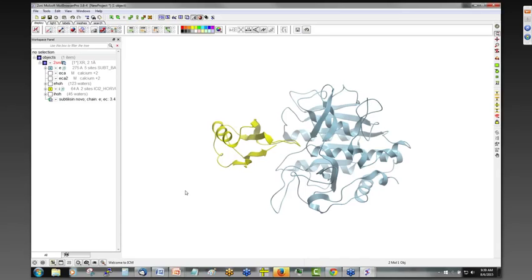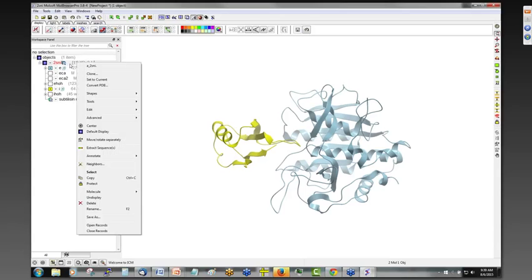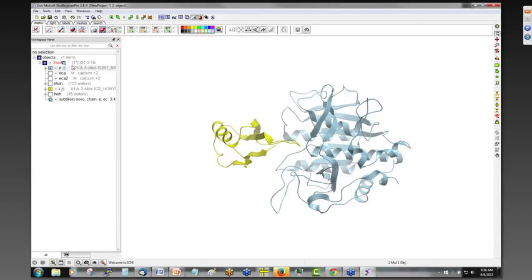nucleophilic attack. So to do this, we'll right-click on the object. So any right-click option or these drop-down buttons, they only respond to whatever you do it on. So if you right-click here, it will only respond to the E subunit. But I want to do it for everything, so it's the whole object. So it's 2-SNI. You may have noticed I've been clicking these buttons here as well.